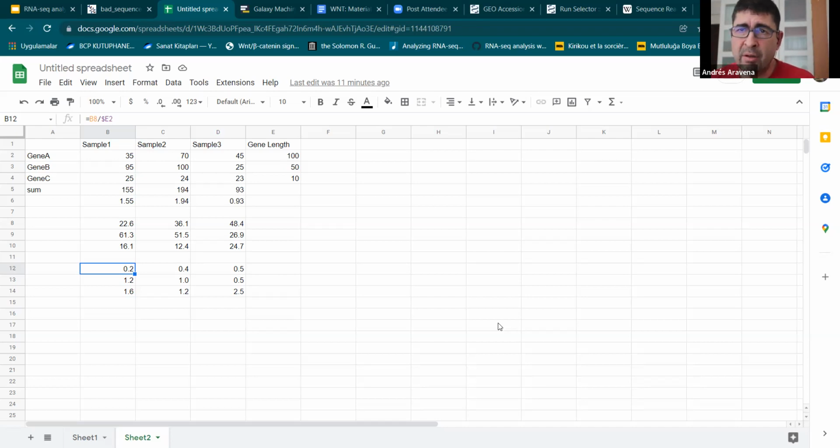And here we have another source of noise, which is the splicing, the shotgun of the messengers. The messengers that we read are a source of noise, and I don't know how much we can control that. My point is this: even if you do the best wet lab procedures, you still have noise that cannot be avoided. And the question is what we do to get a biological conclusion.